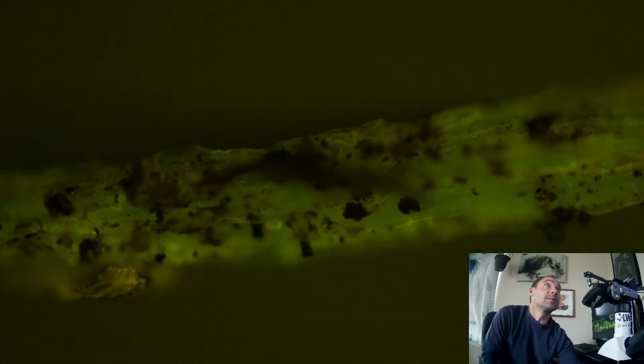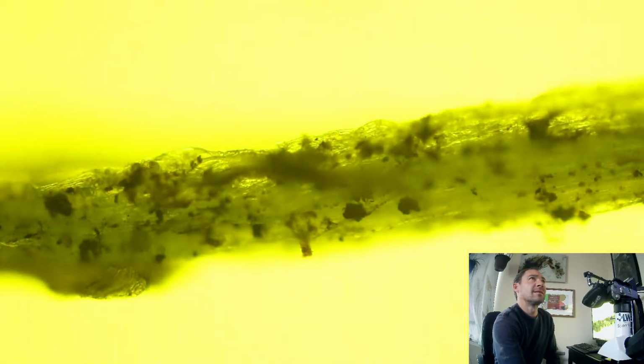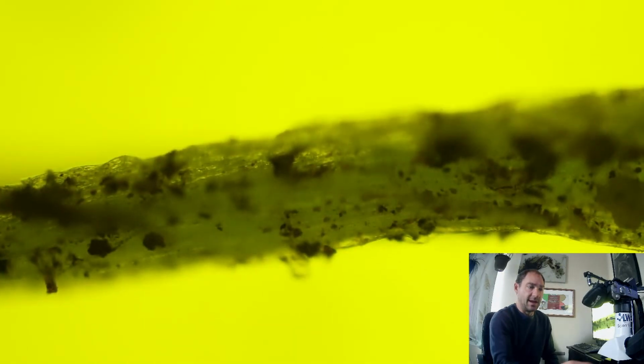Let's bring you up. Yep, there we go. Turn up the light. So now we're using the bottom light. Before we were just using the top-down epi-fluorescent light. And if we turn off the epi, this is what the root would look like in regular bright field.